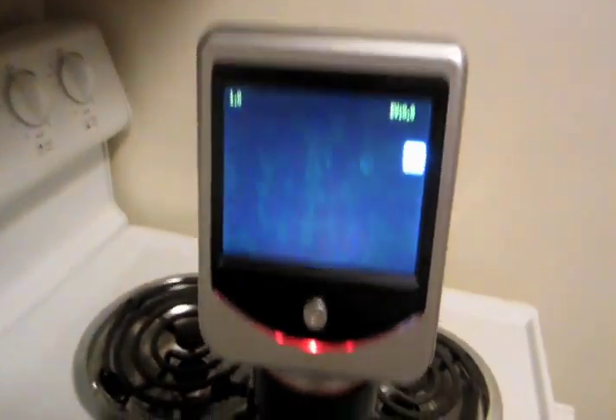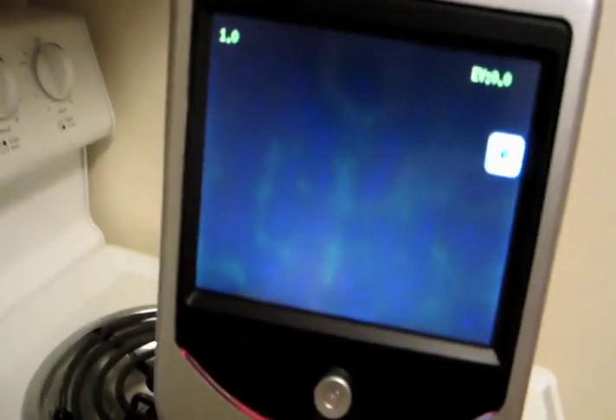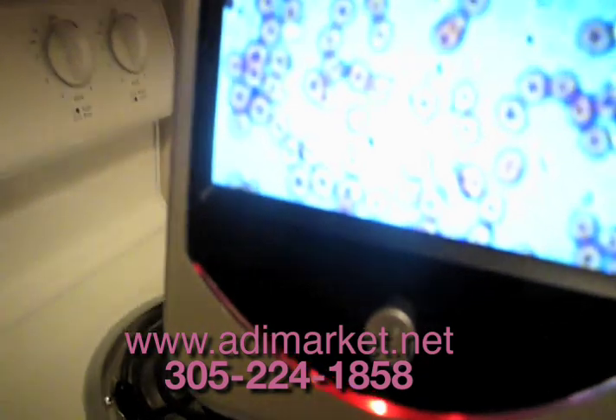Usually you should rotate this up. These are almost parfocal so they're already focused. We'll get a little more light here — here's your light intensity adjustment at the bottom. Bring it up.